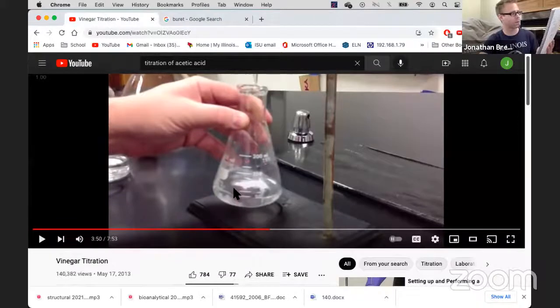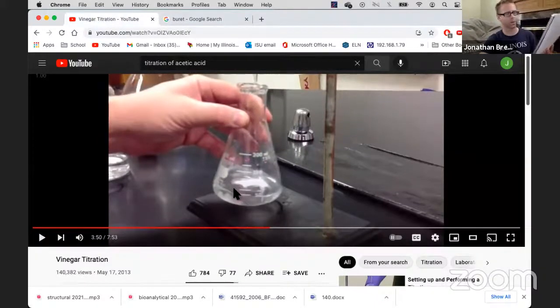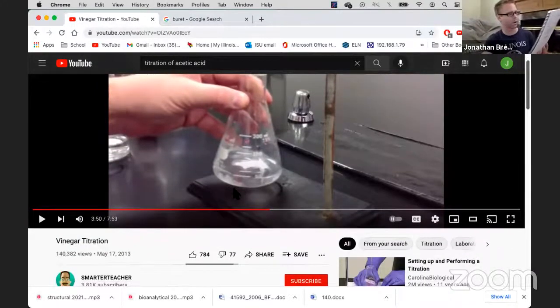And the pipette, the volumetric pipette, we already talked about cleaning that. Make sure liquid doesn't get into the bulb. If liquid does get into the bulb, just let me know. It takes a little bit of practice to figure out the best way to use a bulb, and that's why I use the practice to clean it, as I mentioned earlier.